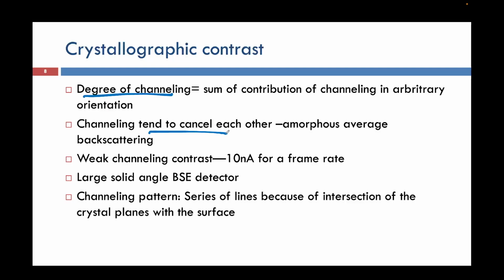Considering the practical difficulties of our experimental setup, we said that 5 to 20% contrast should be there for the naked eye to clearly distinguish. But here the maximum we can get is 5%, meaning 0 to 5% contrast, so this is another weak contrast mechanism.